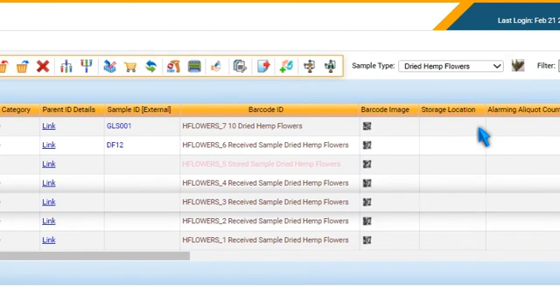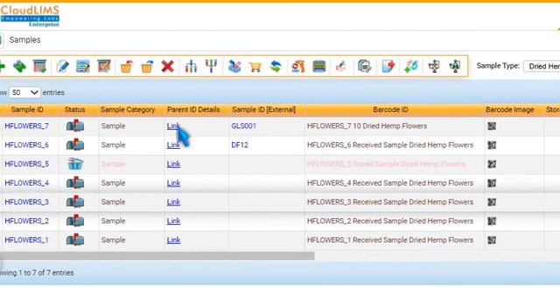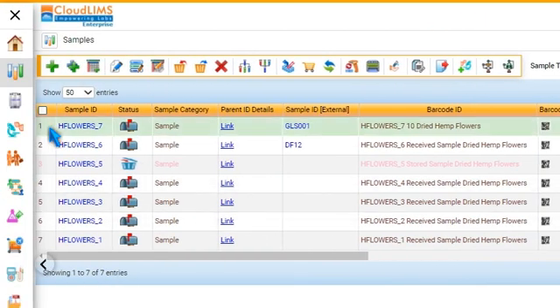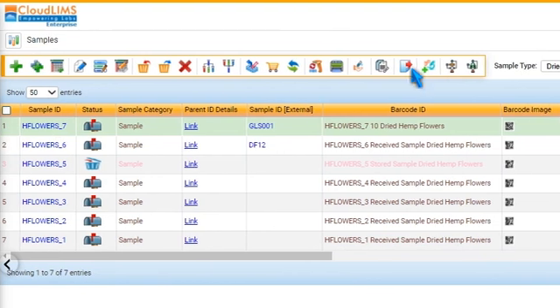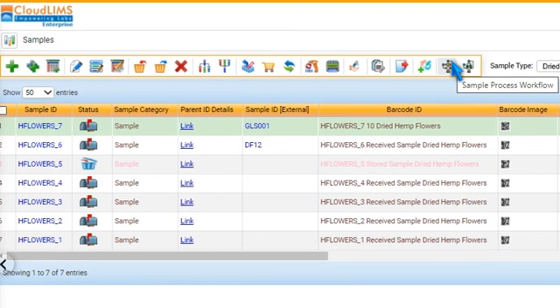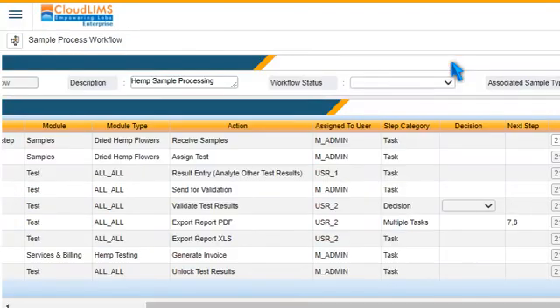To process a sample, select it and click Sample Process Workflow. Laboratory technicians can now commence the workflow according to the tasks assigned to them.